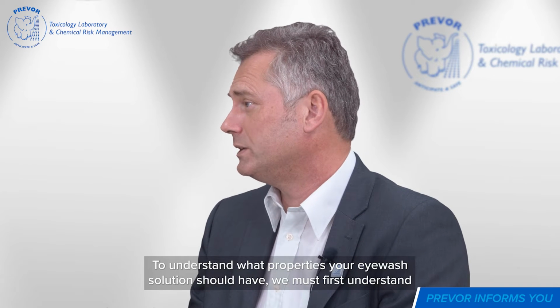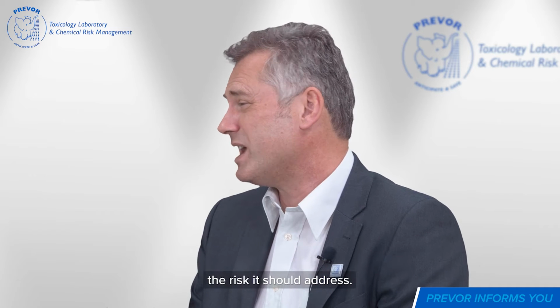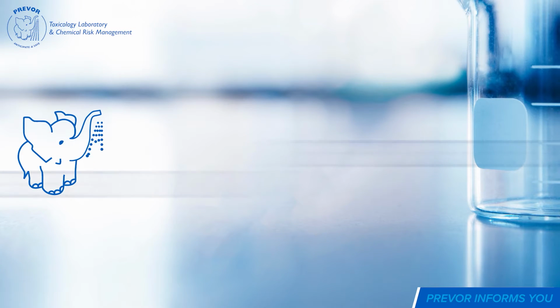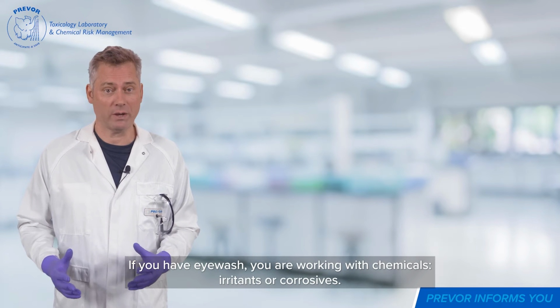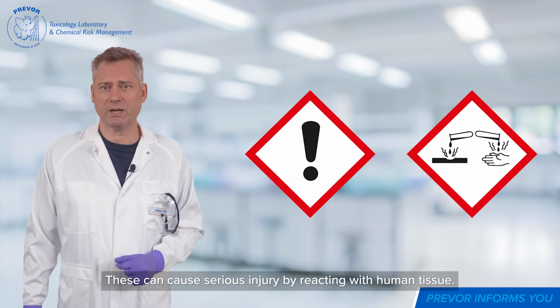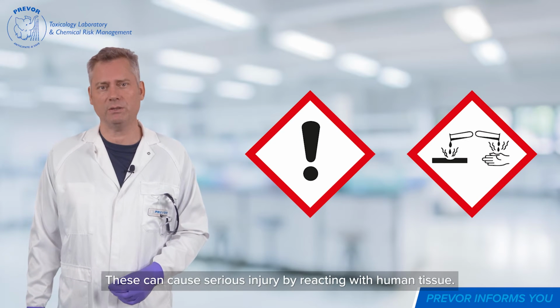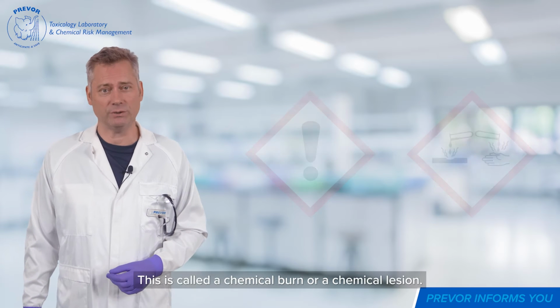To understand what properties your eye wash solution should have, we must first understand the risk it should address. Here, look. If you have eye wash, you are working with chemicals, irritants or corrosives. These can cause serious injury by reacting with human tissue. This is called a chemical burn or a chemical lesion.